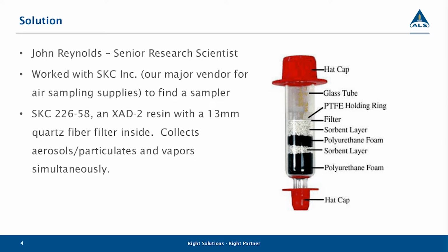And he was personally assigned with figuring out the solution to not enough time to develop individual pesticide methods. So he worked with SKC and did a lot of research and found that they were working on developing what they call a versatile sampler. It was meant to capture as many different kinds of organic compounds as possible. He worked with them to give suggestions on the type of filter they might use.